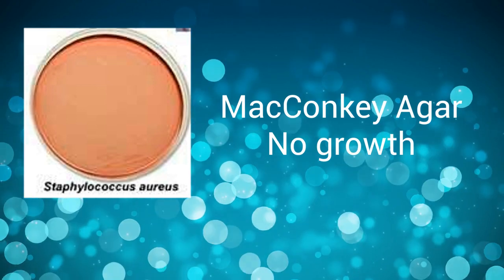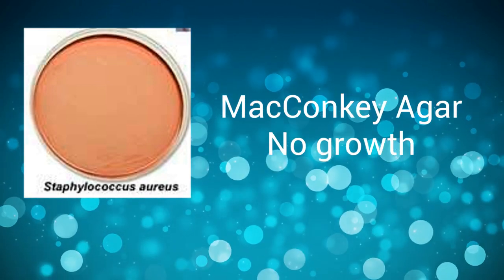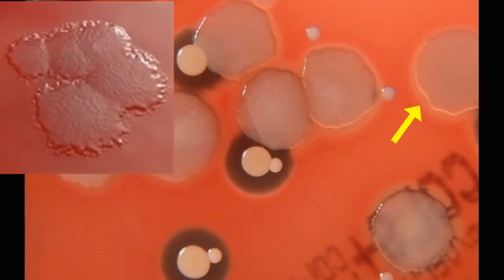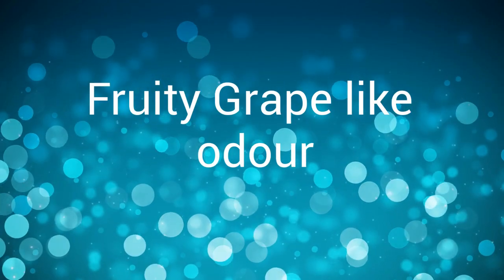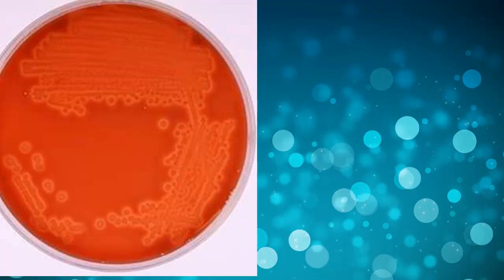Growth of Staphylococcus is inhibited on MacConkey agar by the presence of bile salts. Large beta hemolytic opaque colonies with metallic sheen and irregular margins are seen with Pseudomonas species. Presence of fruity grape-like odor on opening the plate is another feature of Pseudomonas. Also, it produces non-lactose fermenting, that means pale yellow colonies on MacConkey agar.